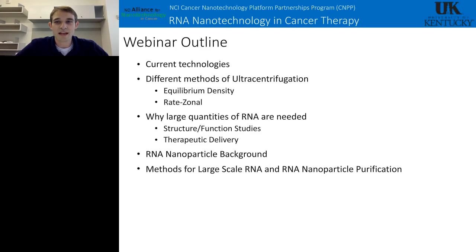Initially, I'm going to start with some background on RNA. It seems like people watching now do have some background with RNA, but I just want to give an overview for those of you that don't know too much about it. And then I will go into some of the current technologies that are used to purify RNA, some issues with those technologies, in my opinion, and how we can improve them by using ultracentrifugation.